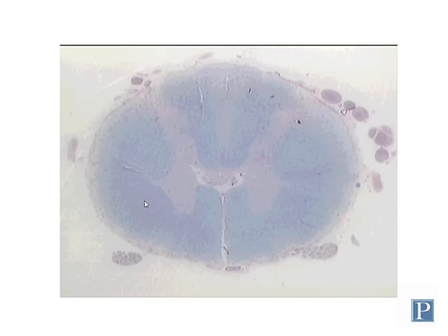In other words, in the brain, the gray matter is on the outside, the superficial-most layer, and the white matter is deep to that. There are some exceptions we'll talk about later, but generally that's how it's distributed. In the spinal cord, it's kind of the opposite. The white matter is on the outside, more superficial, and the gray matter is deep to that. So this is all white matter that you can see here. And the gray matter that contains the cell bodies of most of the neurons, here you can see.